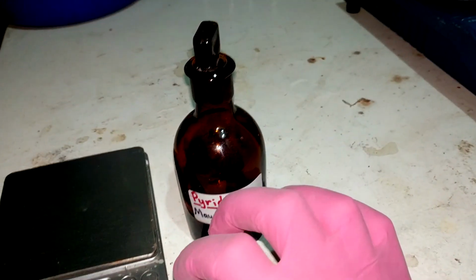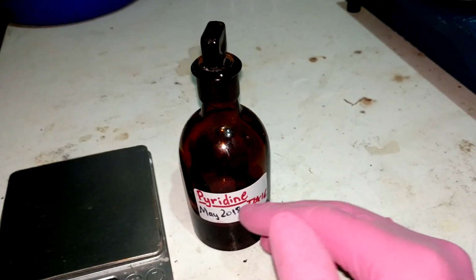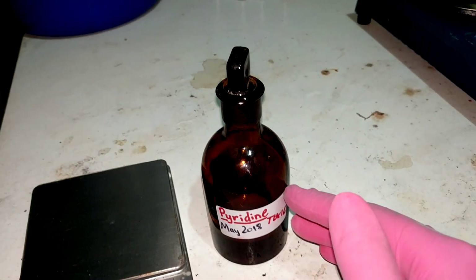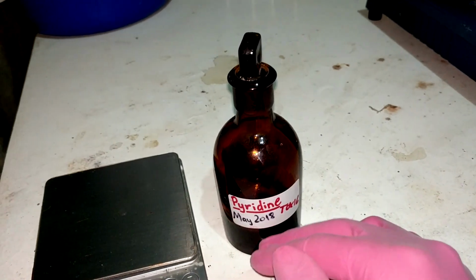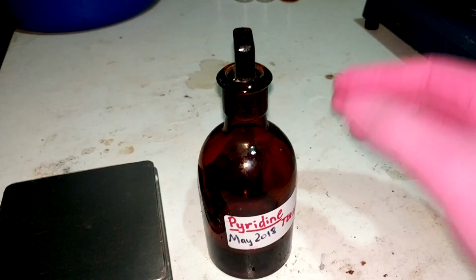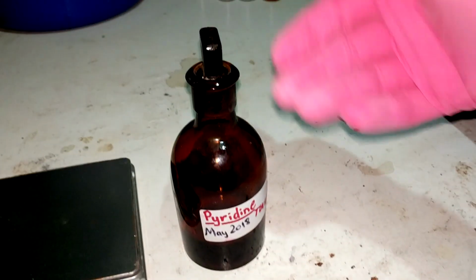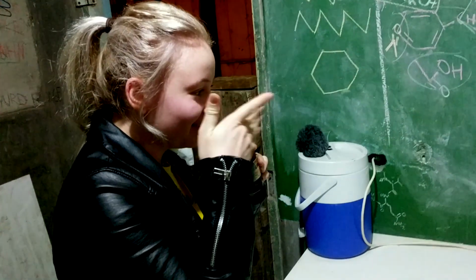So perhaps it did have some effect, but there's also other issues like our collection efficiency, whether we actually managed to condense it all down or any evaporated off, and mechanical losses. But all of them are quite small, especially seeing as pyridine has a boiling point of 115, so not much boils off at room temperature. And it's quite a good jar, it seals quite well, so I don't have to deal with smelling it unless I intentionally open it and force people to smell it.